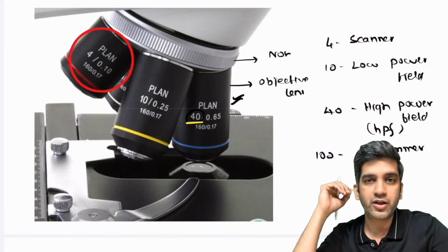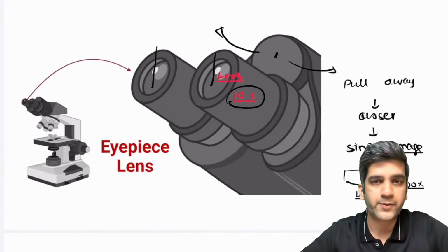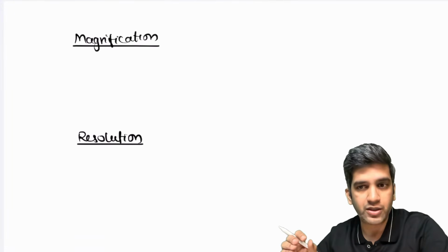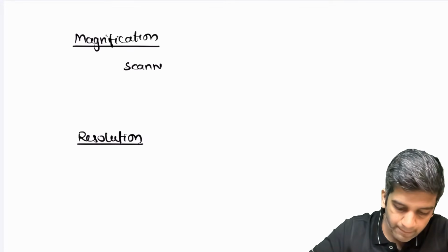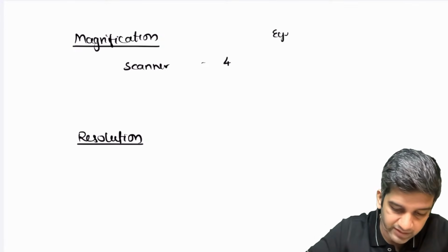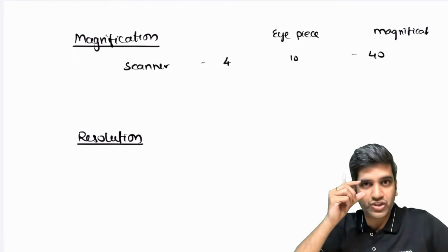It's getting magnified 400 times. Why? I have this base 40 and I'm sure you remember this. So when someone asks what is the magnification power of a scanner, it is 4 into 10. When I say magnification, the scanner view magnifies something 4x of the objective, plus don't forget, the eyepiece has already 10. So the magnification power is 40 times. Scanner view will magnify something 40 times what you see with the naked eye.